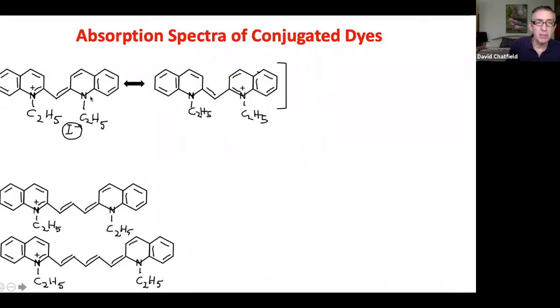So let me go then, share my screen. The topic of the experiment is a set of molecules. We have three, A, B, and C. They've got long names that you can find in your lab description. Each of them contains two ring structures connected by a linker, a carbon atom in this case, 3 in this case, and 5 in this case. You'll notice there's a nitrogen with a plus charge here, neutral nitrogen here.